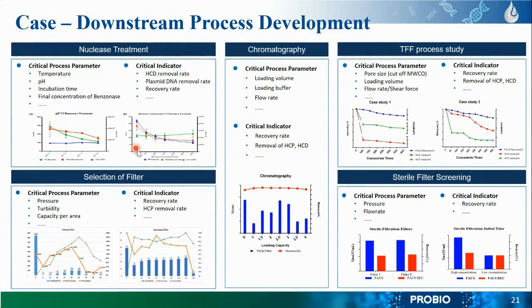For example, if you are talking about TFDF, the molecular weight cutoff is between 100 to 500 kDa. The membrane cassette is from 100 to 300 kDa. The use of hollow fiber devices can result in lower shear rates when compared to membrane cassette devices, which are usually used in manufacturing of several viral particles.